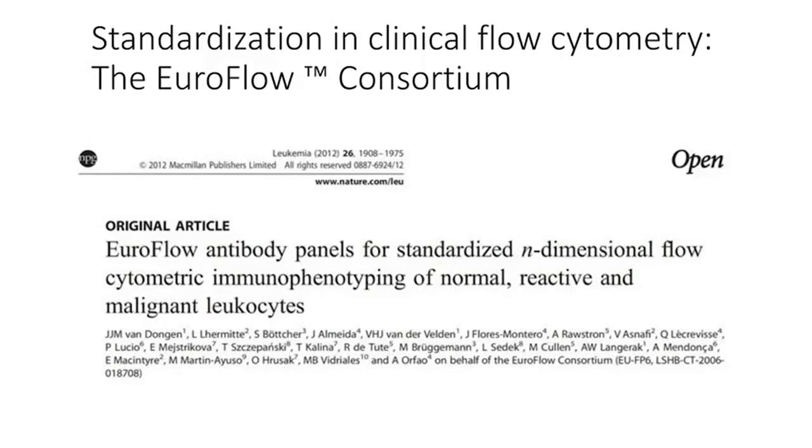The EuroFlow group has done a tremendous effort to try to change that and standardize our work in clinical flow cytometry. I'm showing here one of their seminal papers in which they describe a series of antibody combinations using standard protocols that were developed and validated extensively.